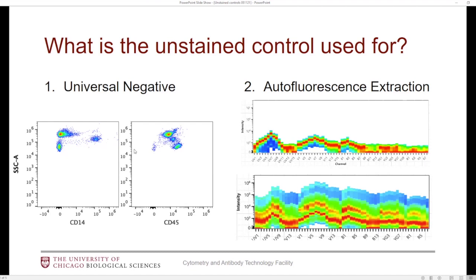Another example is CD45, where pretty much all of our cells in the sample express the marker and we don't really have much of a negative population. In this case, maybe the software would give us an error message and say we don't have enough events in the negative gate, or the autofluorescence properties may not match between these two populations. So in this situation, I would always also use the universal negative.